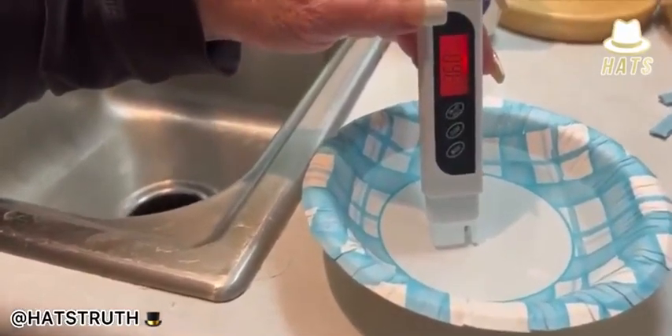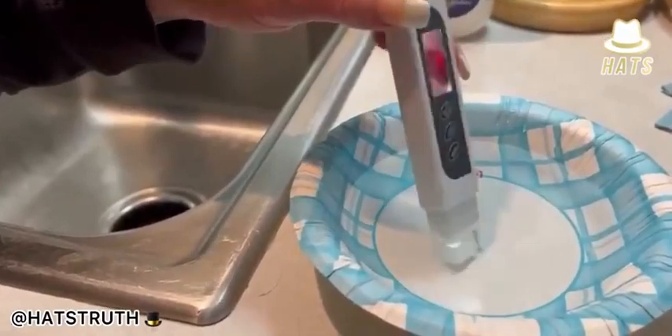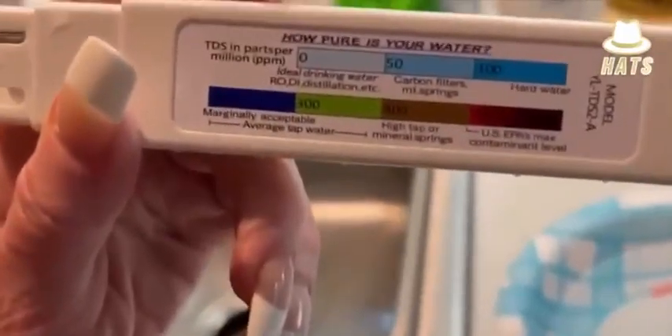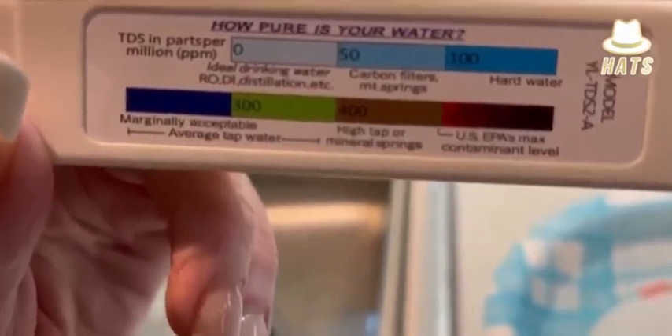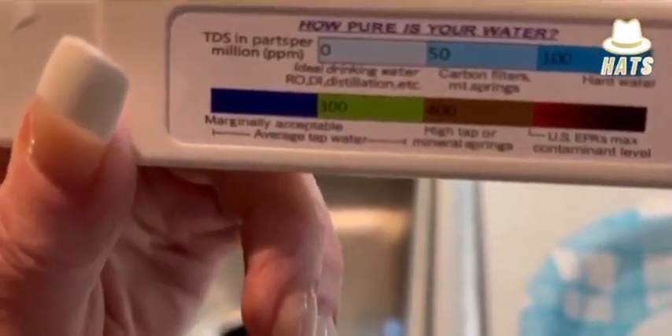The tap water is in the red at 360. Let's take a look at what the red means. The red indicates the U.S. EPA's maximum contaminant level. The green is marginally acceptable.